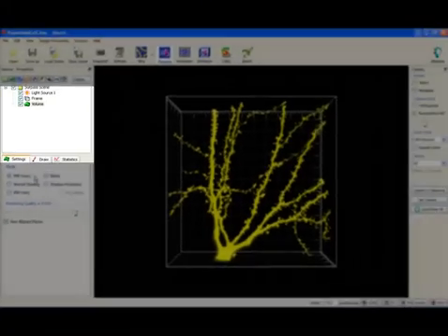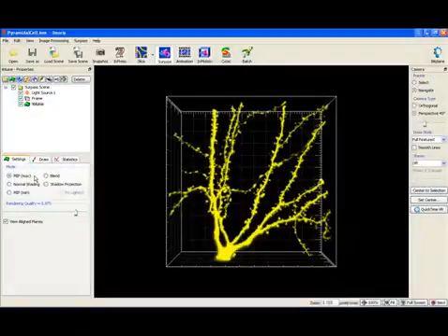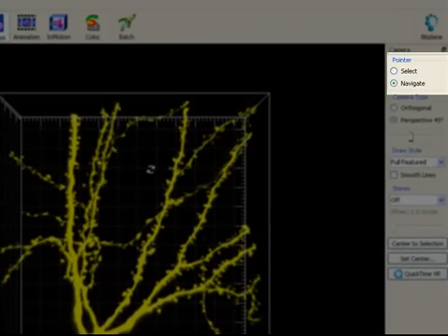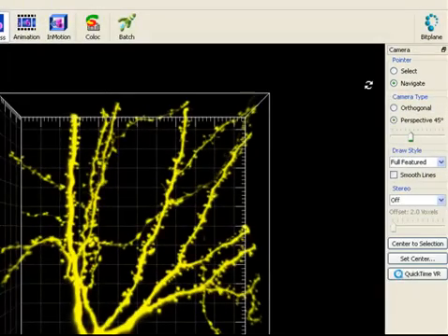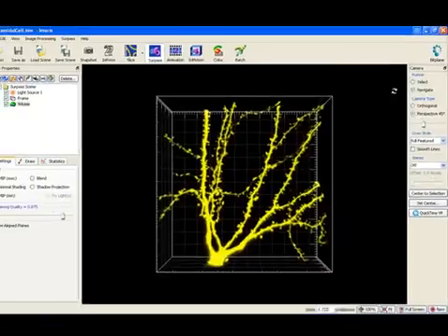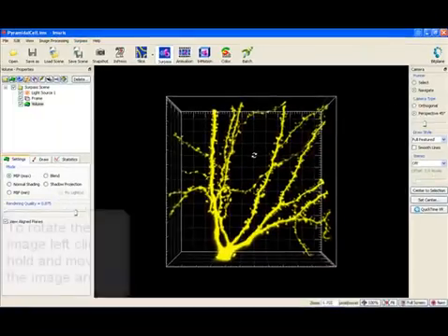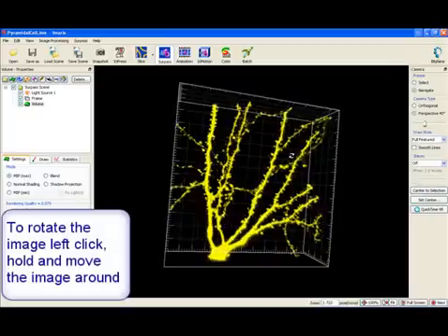We will now start the image rotation. To do this the mouse pointer must be in Navigate mode. Left click anywhere within the image and by holding and moving the mouse the image will start to rotate in that same direction.